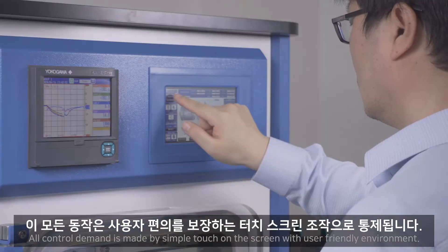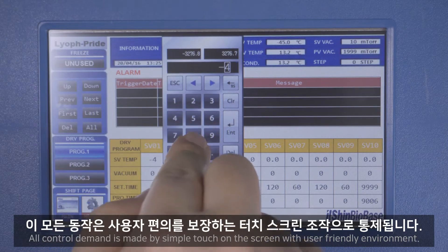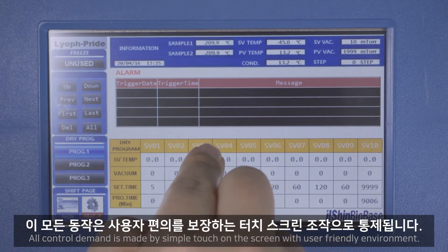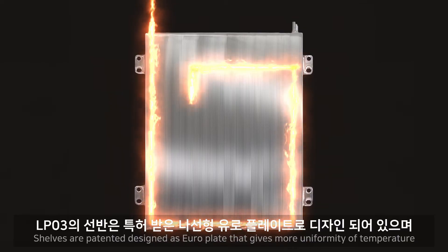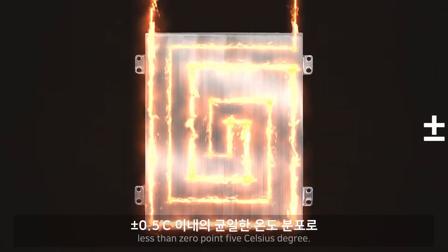All control is managed through a simple touchscreen with a user-friendly interface. The shelves feature a patented design that gives greater temperature uniformity of less than 0.5°C.